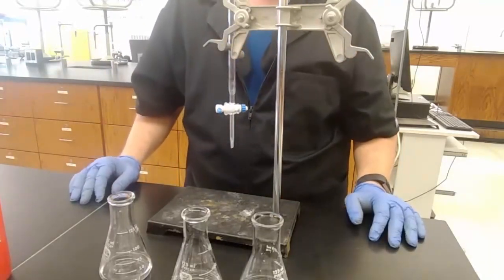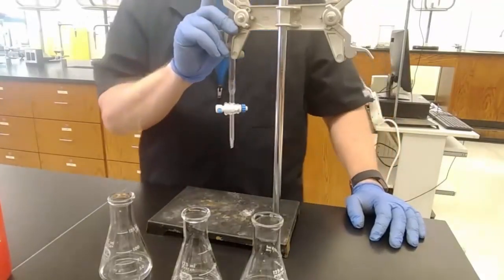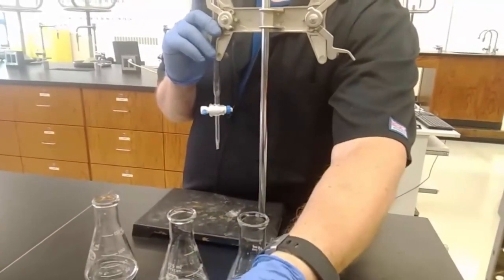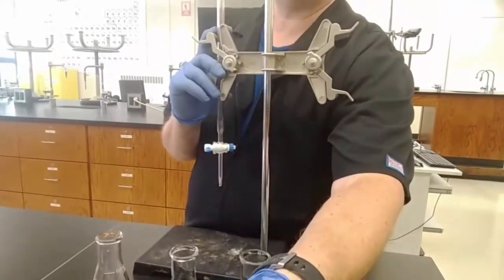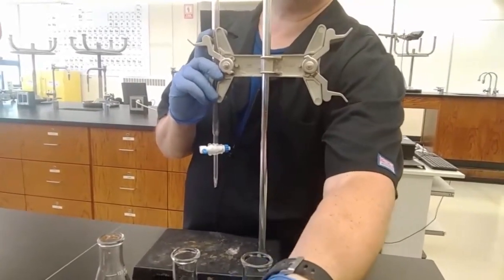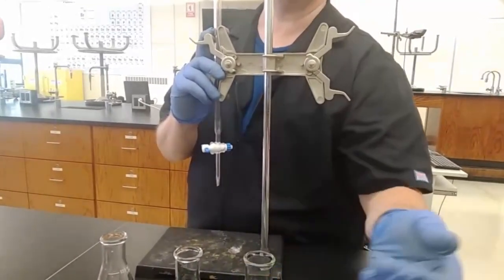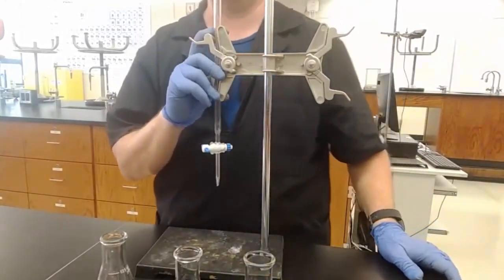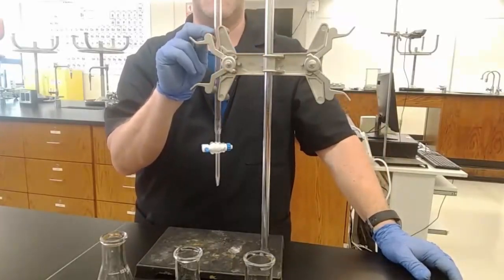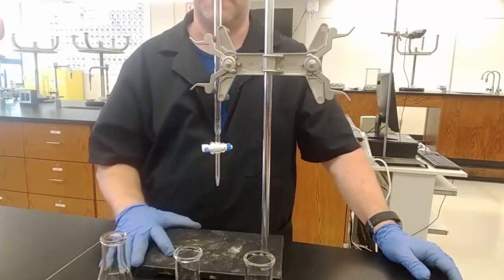That means that we have to record our data to the hundredths place, because if I just write down 20.2 milliliters as my reading, then that is assuming that I have guessed the 0.2, that it was somewhere between 20 and 21, and I guessed the 0.2. On here, I'll be able to tell whether it is between 20.1 and 20.2, and I have to guess the hundredths place. Okay?